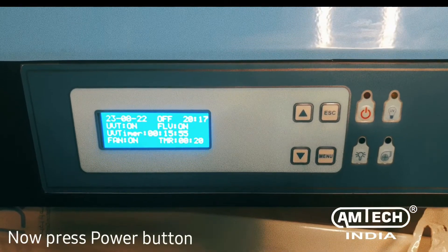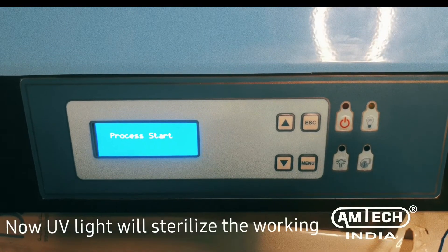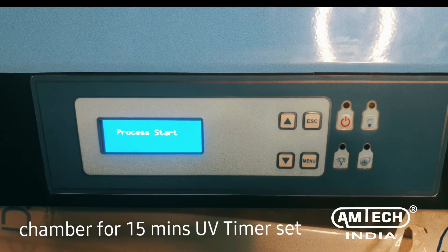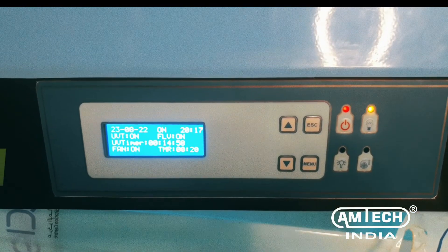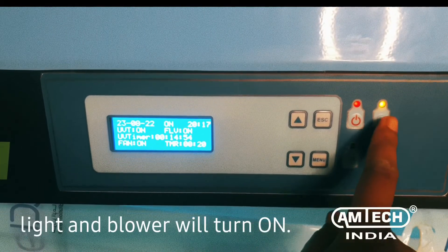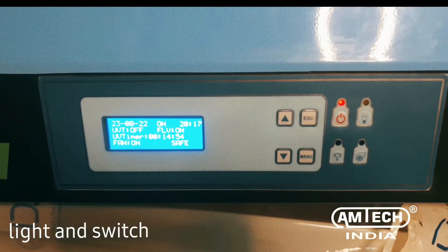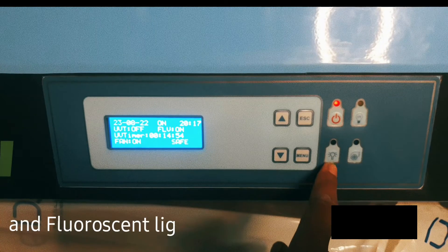Now press the power button to start the operation. The UV light will sterilize the working chamber for the 15-minute UV timer set. After sterilization, the fluorescent light and blower will turn on. For the demo, we are switching off the UV light and switching on the blower and fluorescent light manually.